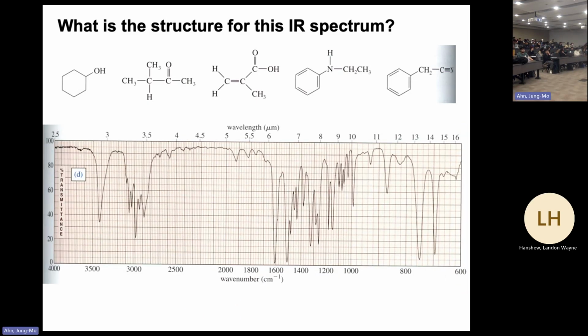And the last one, what is the first thing you could look at? That one, right? This is 3400. We got a pretty moderate intensity signal band right there. And that's a little too high for a 3300, but as I said, this number can change depending on how much hydrogen bonding there is. So we have a candidate for amine, hydroxyl groups, maybe triple bonded carbon hydrogen stretching, but we don't have this one, so we can eliminate it.